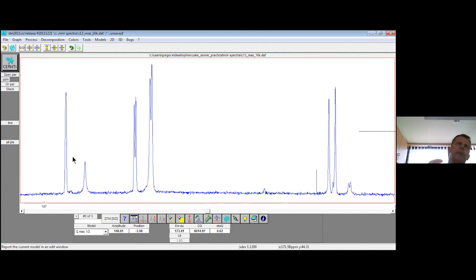Typically, the NMR study goes like this: we first discuss with the one who prepared the material what the questions are, what the composition of the material is, and what would be the interesting nuclei that could provide us useful information. For example, we were studying organic molecules adsorbed into a zeolite, trying to see how these molecules are packed into the channels.